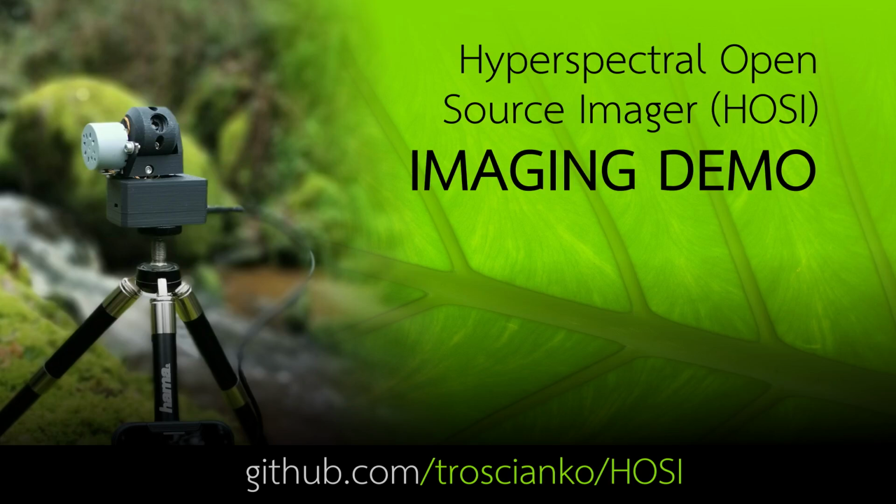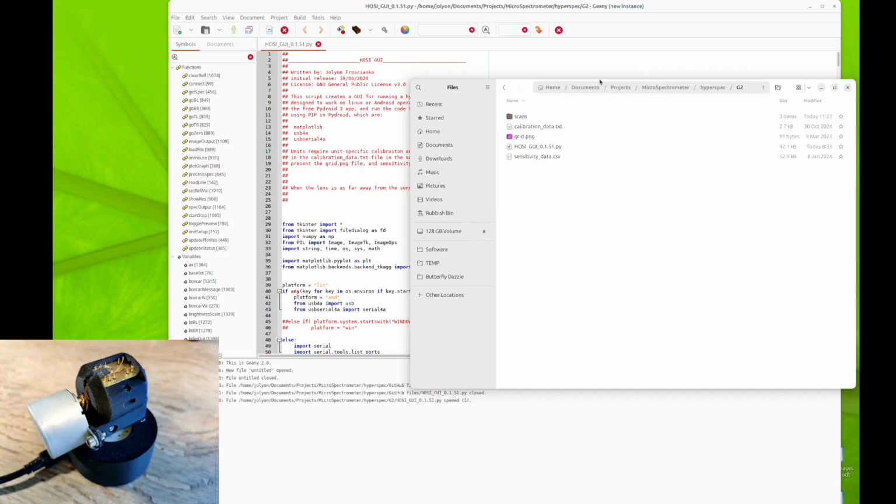This video will show you how to use the HOSI GUI. That's the graphical user interface for this hyperspectral open source imager. So first off, you need to set up your working directory. And in there, you'll need everything shown here.